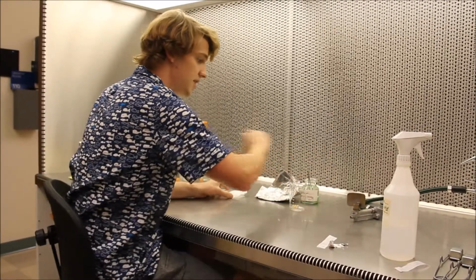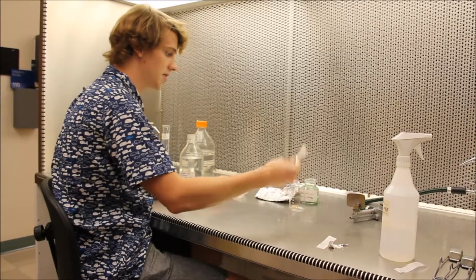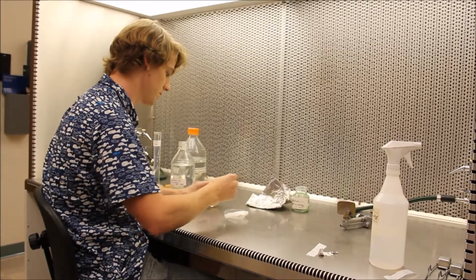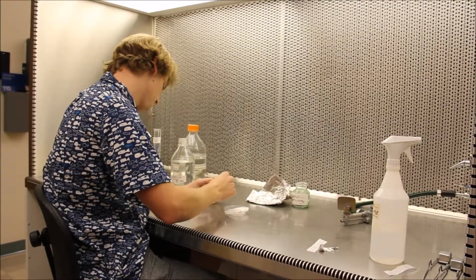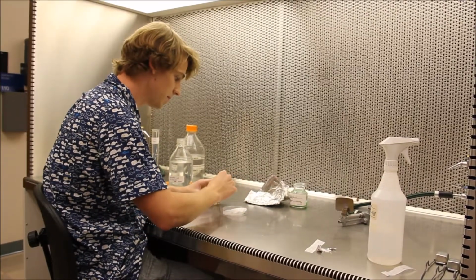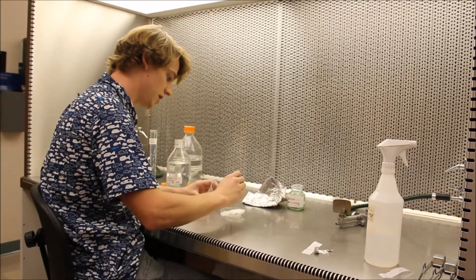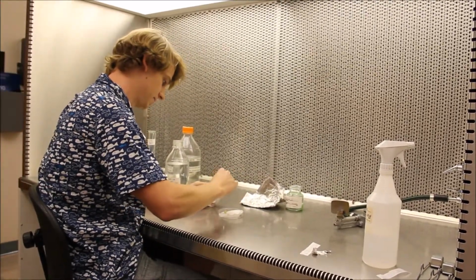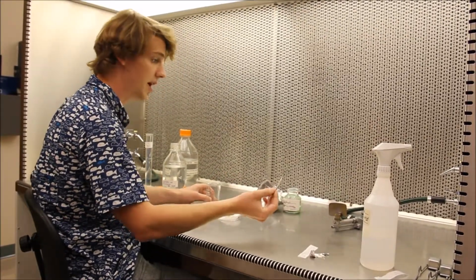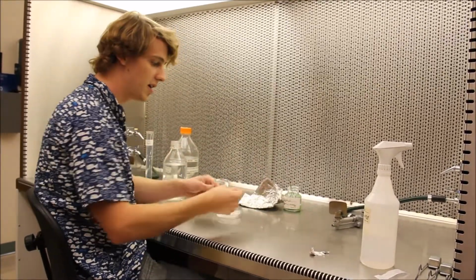Now you're ready to put your seeds onto the filter paper. So once again, flame your forceps. Go in there and move your seeds to the filter paper. Oh, it's stuck. Now we are done. Put the lid back on and you prepare your plate.